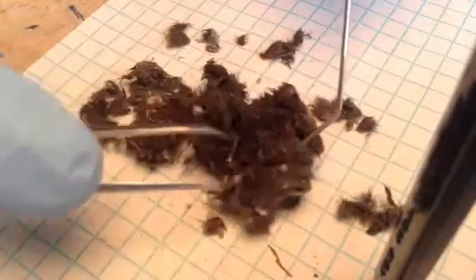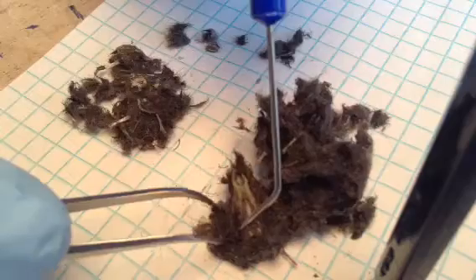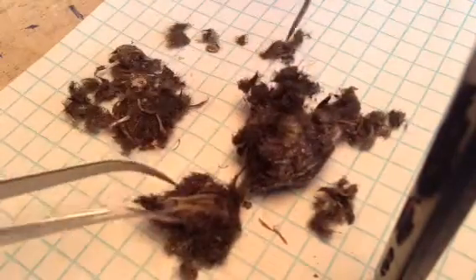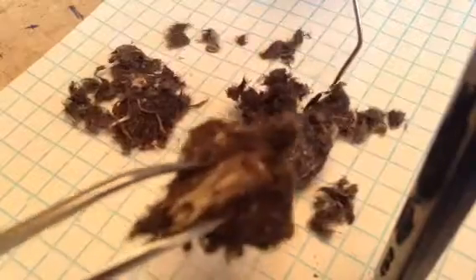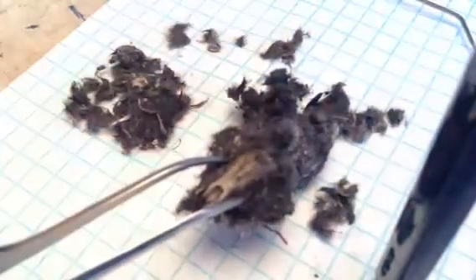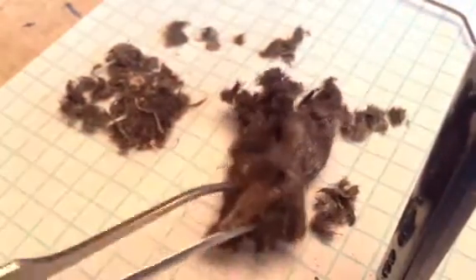Looks like this owl has eaten a whole skull. Look at that — that is something else. See if we've got the whole nose in there. Focus that a little bit. Whole nose — everything.